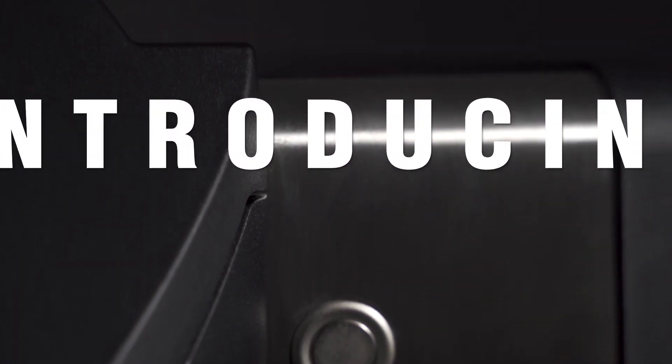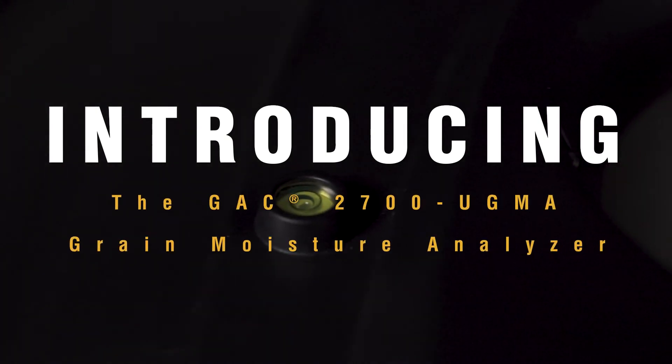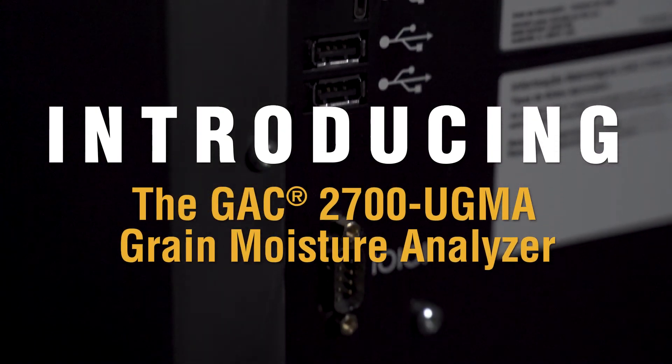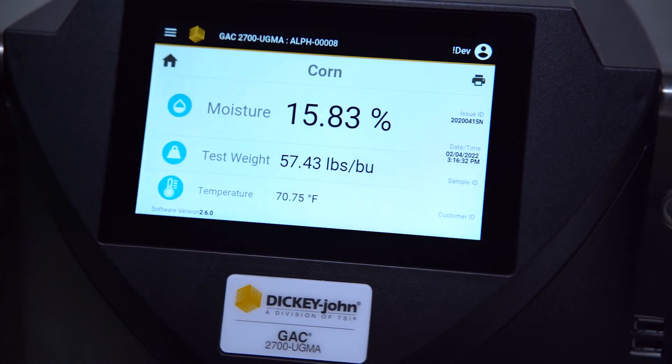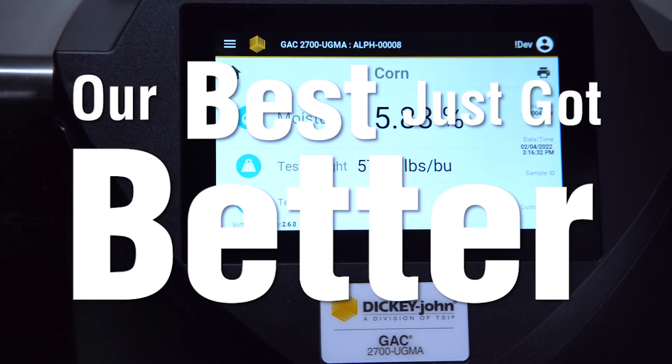Dickey John is proud to introduce the GAC 2700 UGMA Grain Moisture Analyzer, the next generation moisture tester that is full of new features. It will be obvious why we say our best just got better.